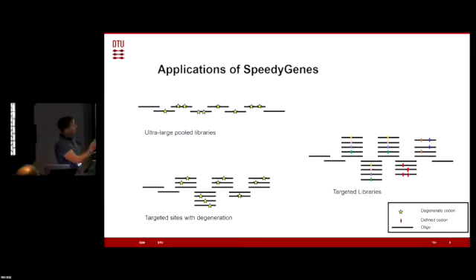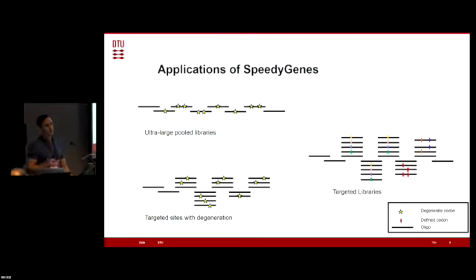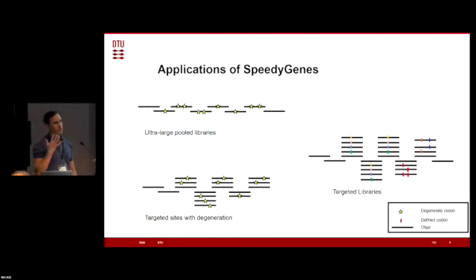So you can do systematic one by one introduction of variation. And then on the right, you can also do fully targeted libraries. If you have, say, 5 separate amino acids and you want to keep them separate at specific positions, you can mix the oligos so that you get all 5 variants at that position, all 5 at the other, and then run all the combinatorials of that as well. It's quite a powerful method with lots of options for making these libraries, whether you want them all pooled together, mixed in, or separate to screen and actually target the effects if you're going to do machine learning down the line.